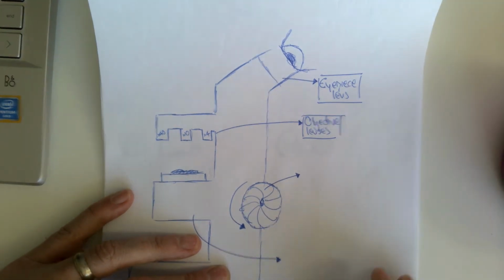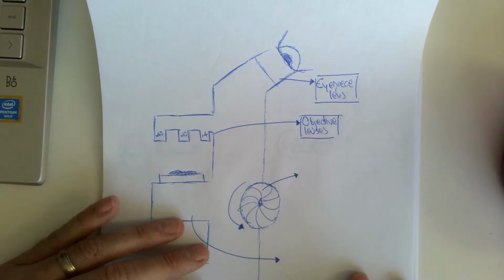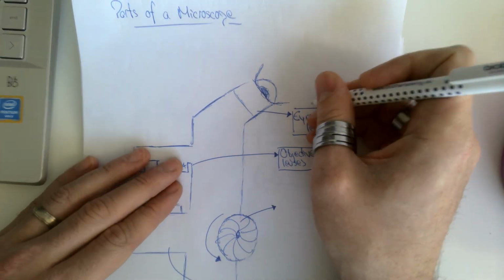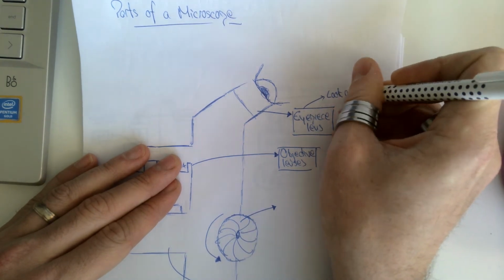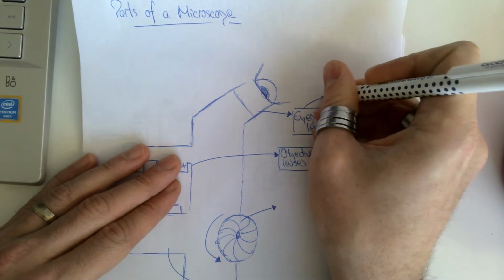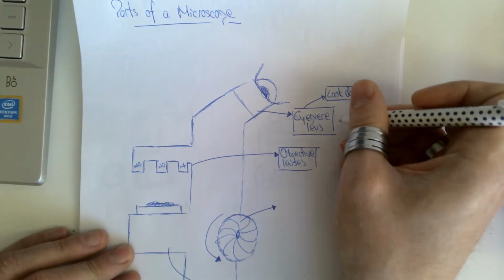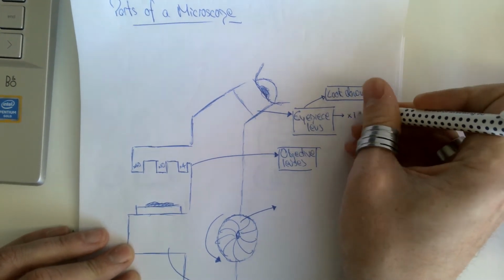Now, obviously, some of this is quite self-explanatory, but let's go through it anyway. So the eyepiece lens, obviously, is the lens that you look down, and it typically has a magnifying power of times 10.